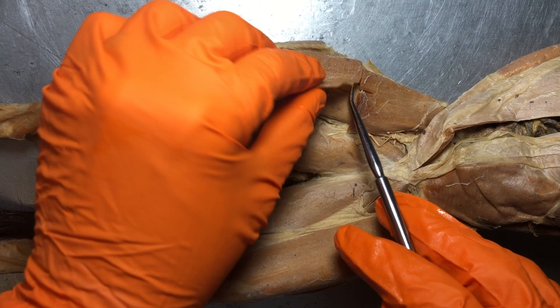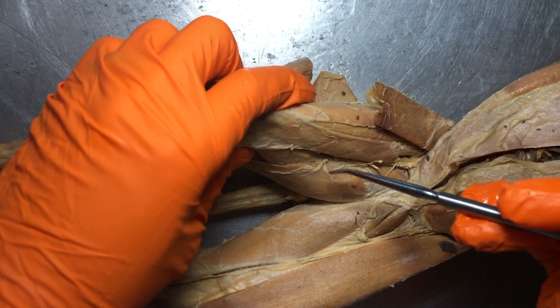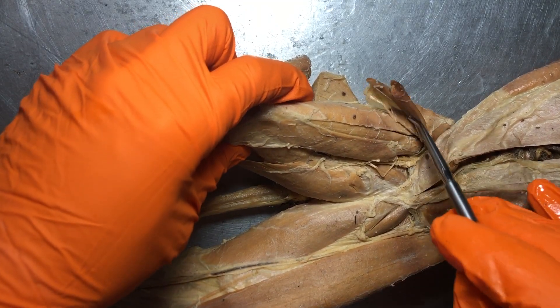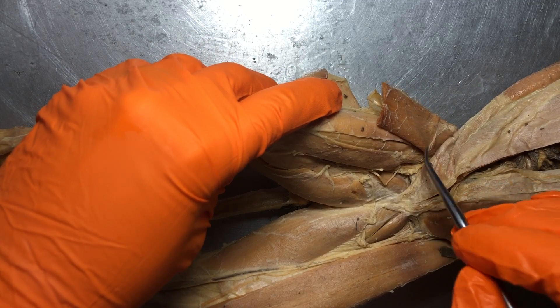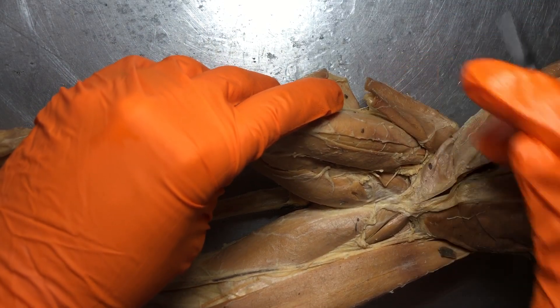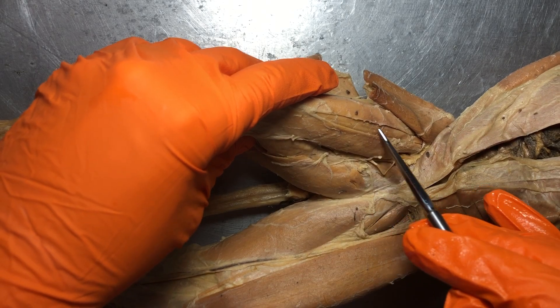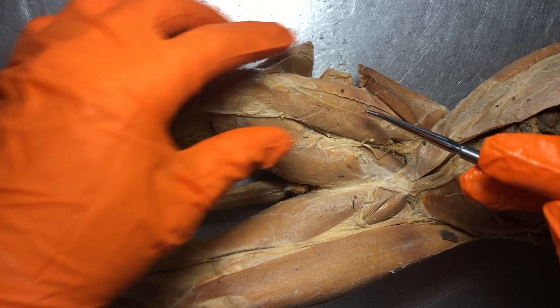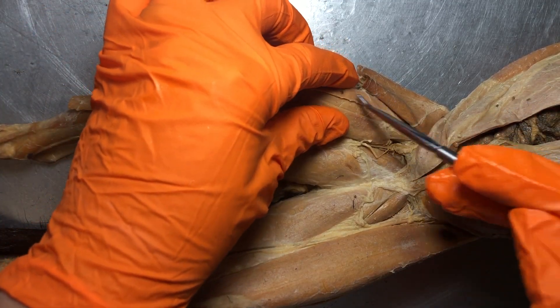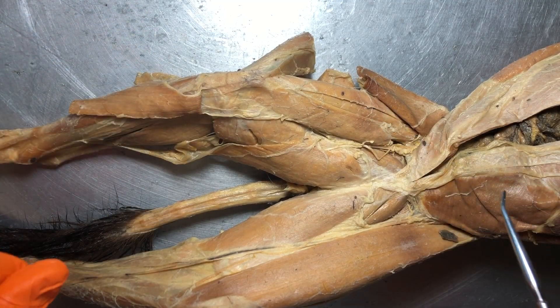The reason why we cut it is because the quadriceps femoris group is here. Remember the 'quad' refers to four — there are four muscles. The only ones we can see here are the vastus lateralis, the rectus femoris, and the vastus medialis. But together those make part of the quadriceps group.